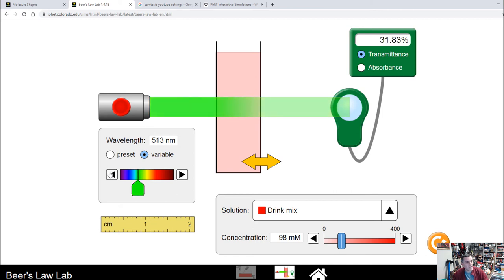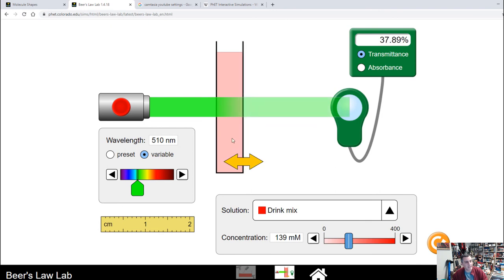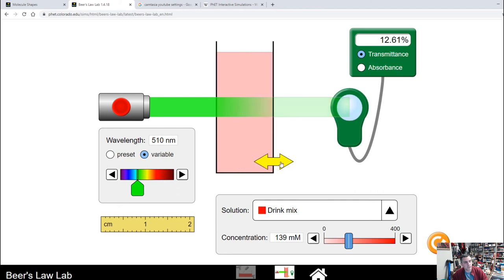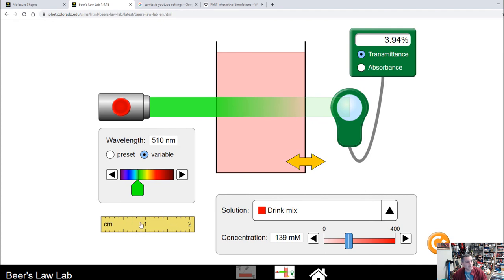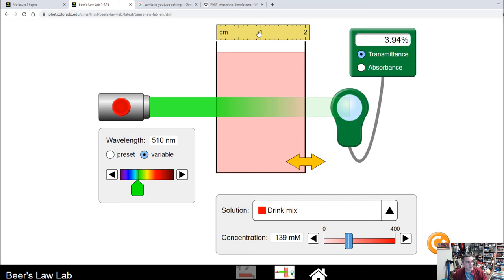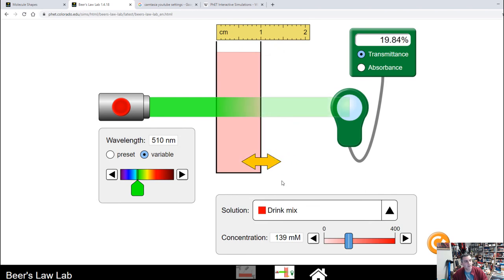Set the wavelength to 510 nanometers — that's the wavelength we use in lab because the red dye absorbs green light most strongly there. If you switch to red wavelength and change the concentration slider, you'll see the transmittance barely changes because red light just transmits through. At 510 nm you get a big response. Also use the ruler to set the path length — drag it over the cuvette and set the sample width to one centimeter, just like in lab.